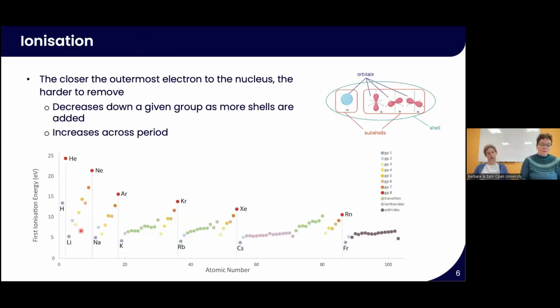So why do we need to ionize particles? First of all, it is then possible to separate the ionized particles in the mass spectrometer. This is why we need ions. And we ionize by basically losing an electron, because we are interested in positive ions.